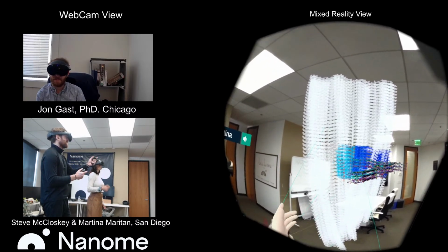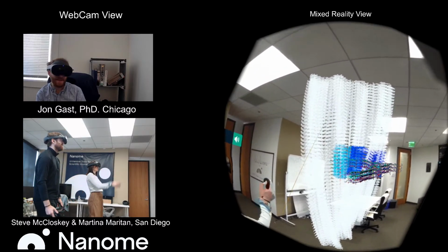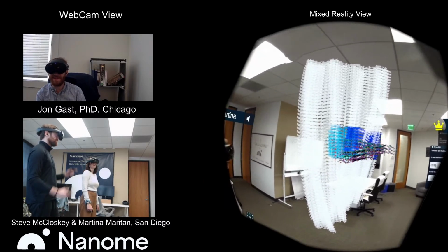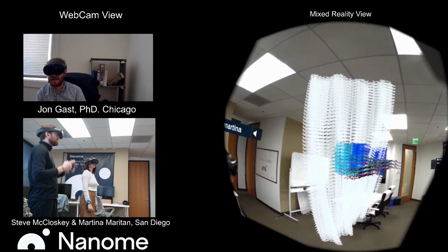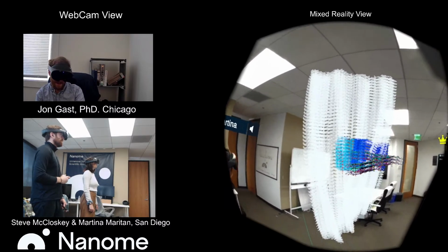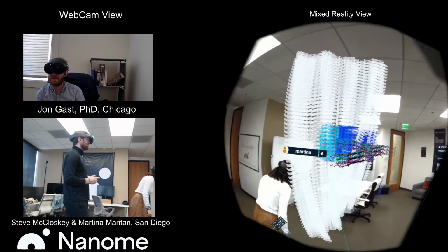Oh, it looks like it loaded. We have the other map loaded there. We have the fibril across the room. That one's much bigger than the last one, but I'm just waiting for the 6LNI to come in and we can take a look at that. Oh, it's already in. This looks pretty cool.